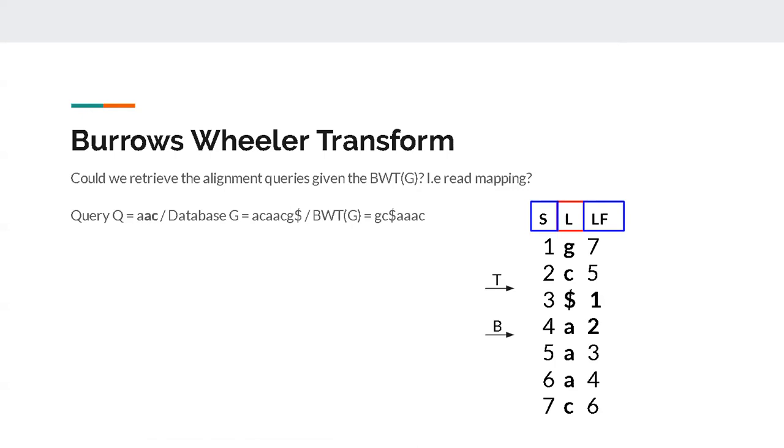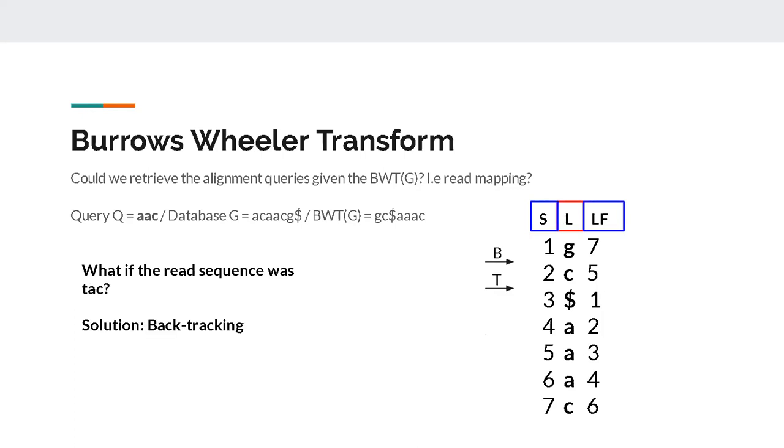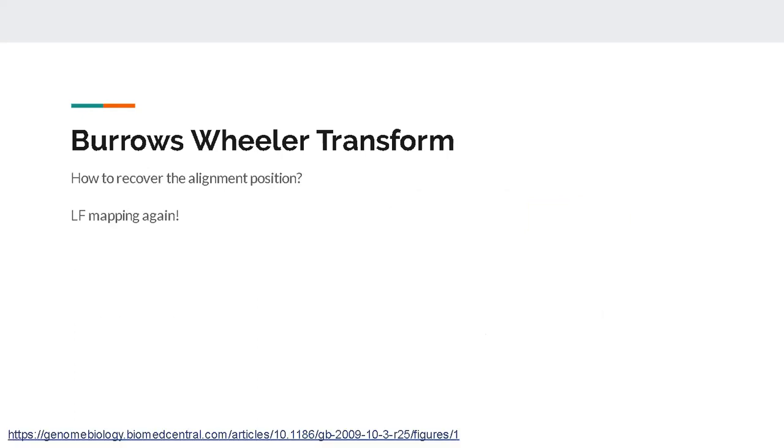So it would put a G, C if it matches, it would put a T, it would put A, T, G, C, it would try everything, and it would try to see if that is what the read has. So when it changes A to a T and it matches this read, it will report the same thing, but also report that there is a mismatch at this particular position. So the solution is backtracking in cases where there are no exact matches.